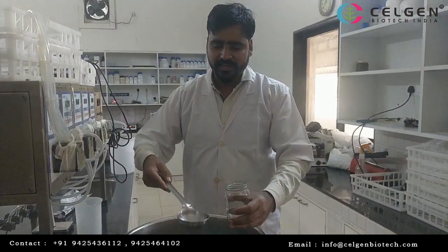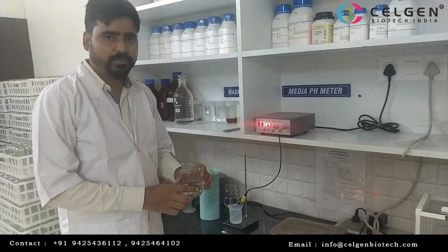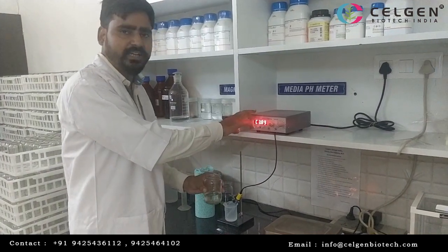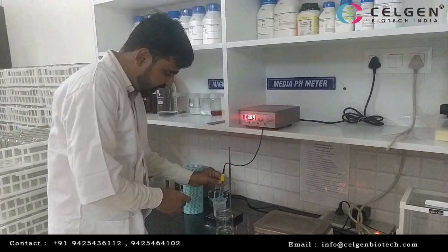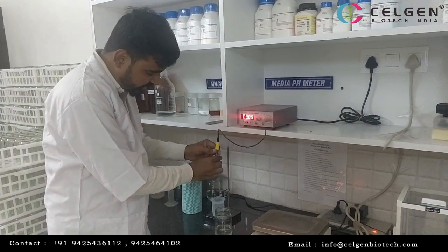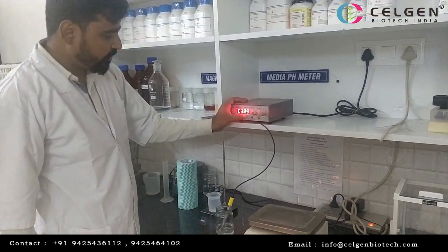Now we are going to check the pH using a pH meter. First of all, we will clean the water. After that, we are going to the pH solution. We will clean the pH.